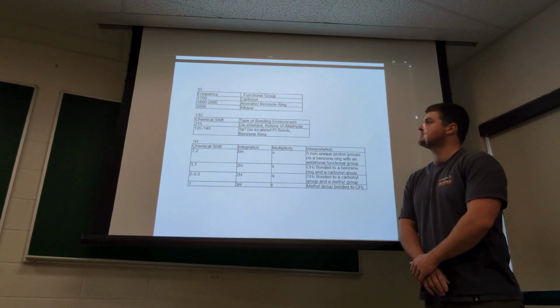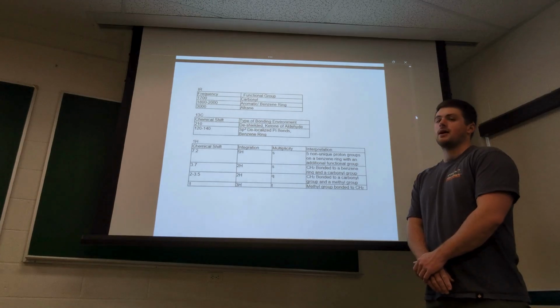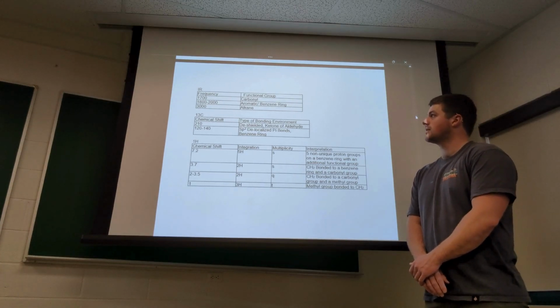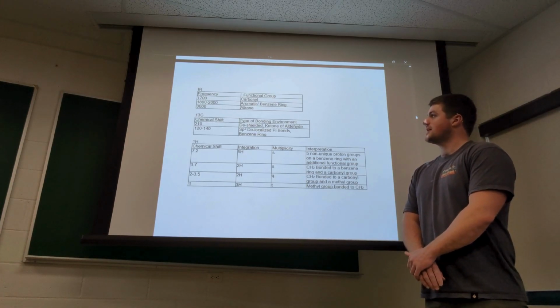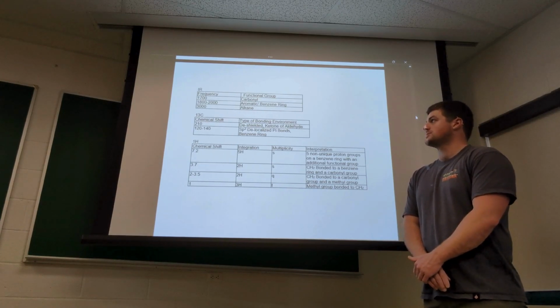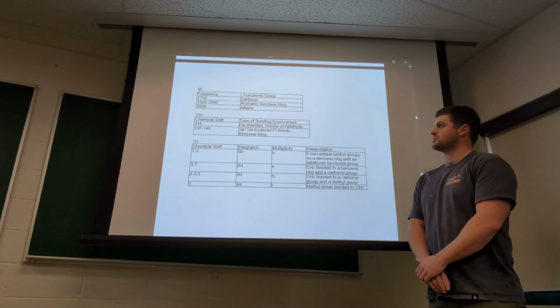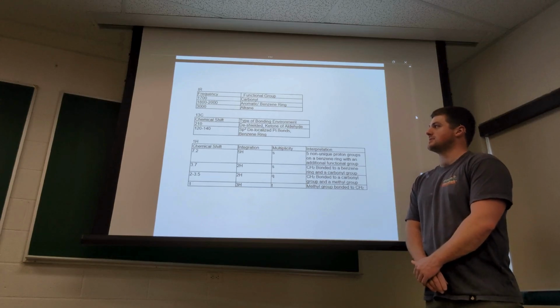In summary, what we've seen in the infrared is an indication of a carbonyl group at 1700, a very large peak there. Just downfield of that, at 1800 to 2000, we have peaks which indicate the presence of an aromatic or benzene ring. And at 3000, we have a peak which would indicate carbon-hydrogen bonds, as in an alkane group.